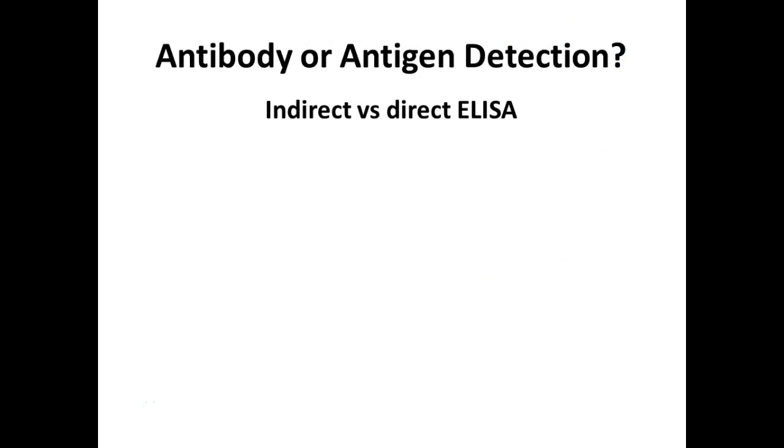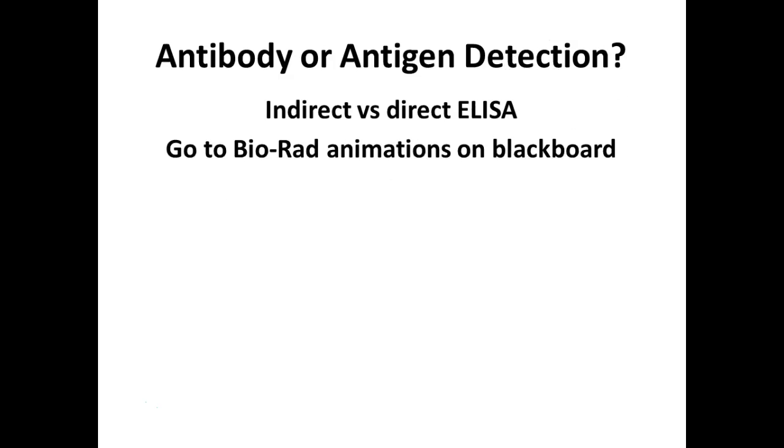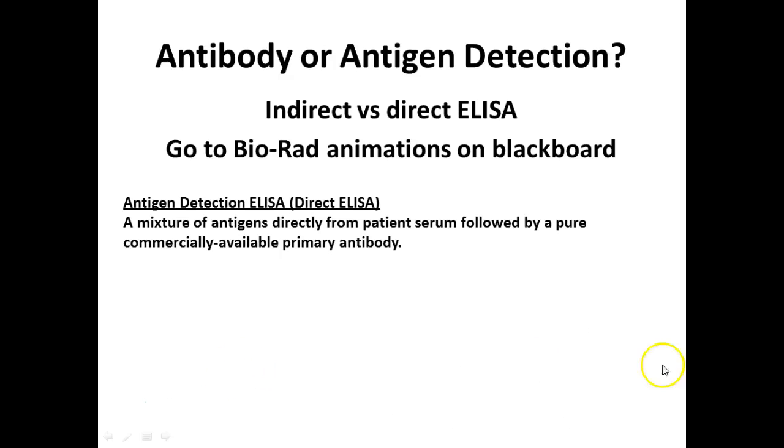So which are we doing? Are we doing antibody detection or antigen detection today? We're doing antibody. So we're doing indirect, not direct ELISA. Bio-Rad has a great set of animations that I have a link to on Blackboard for you guys, and I'm going to show you in a second. They have both animations there for you, and I highly suggest looking at and comparing the two.